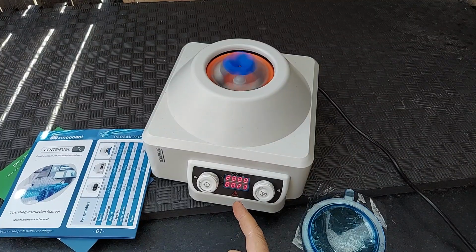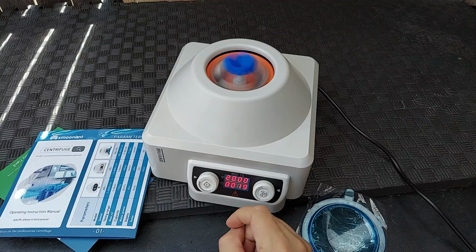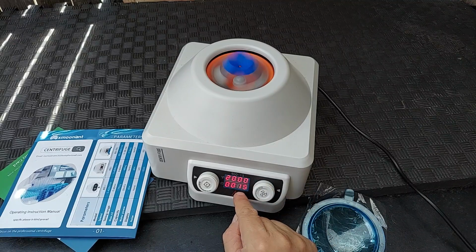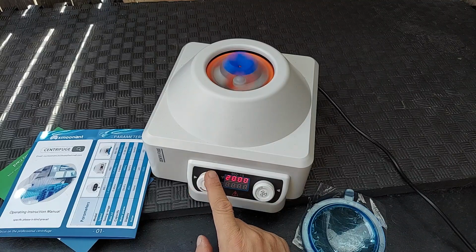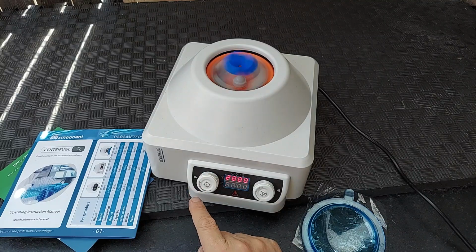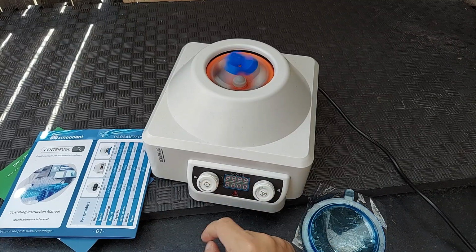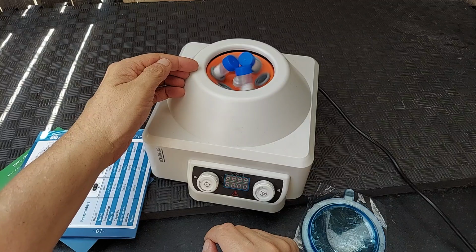As this 3 minutes is about to come due, I had moved it up to about 2,000 RPM. The timer's about to hit for the 3 minutes. We can stop the timer. We can reset it for another 3 minutes. Before we start it though, we'll go ahead and stop. We'll take a look at what's the condition of that cream.